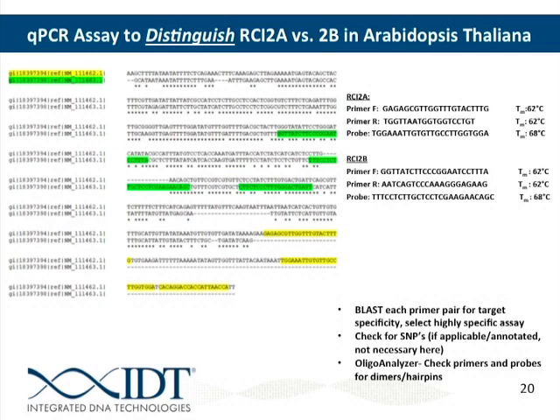So the forward and reverse primer look like they would be a good pair. Now we just want to check and make sure that the probe also doesn't have any potential of forming a dimer with the primer as well. And that looks good too.